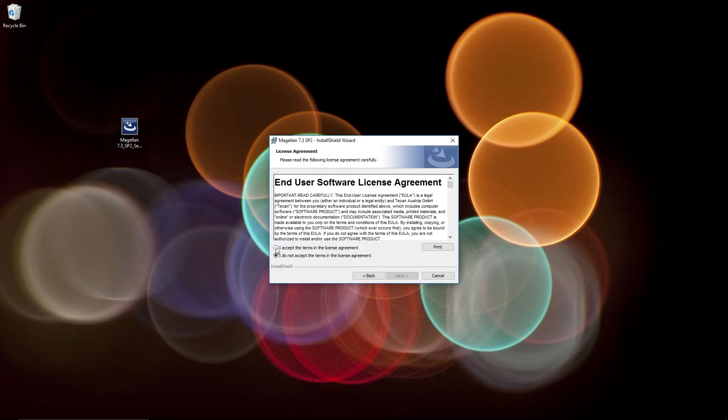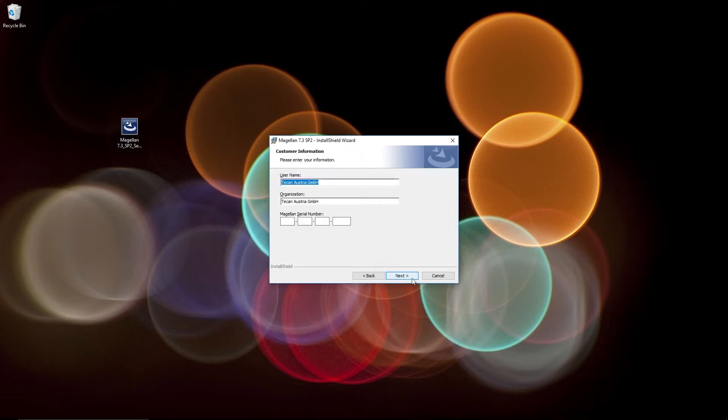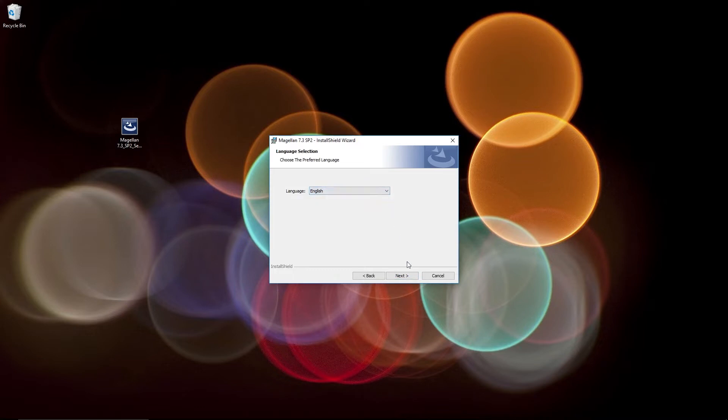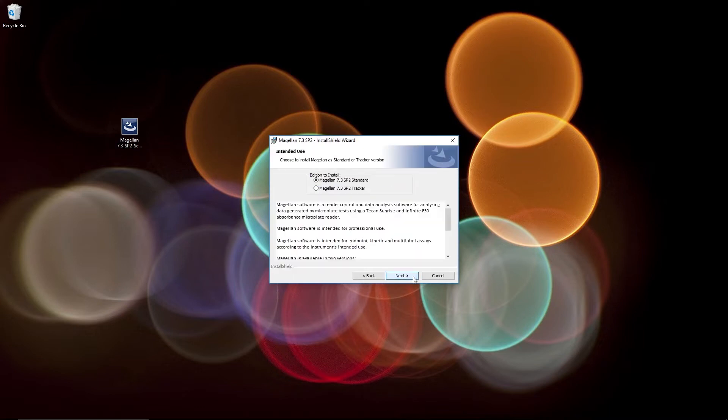Accept the license agreement. Enter your username and the organization. And click Next to save in the default file directory. Choose a language. And select the software version you have purchased. This will be either Magellan Standard or Magellan Tracker.